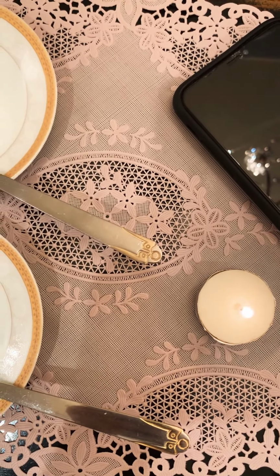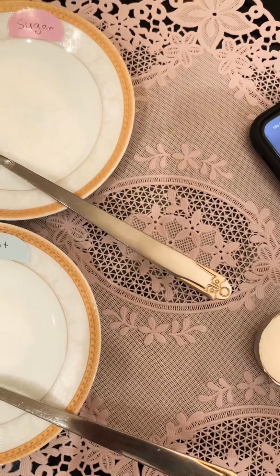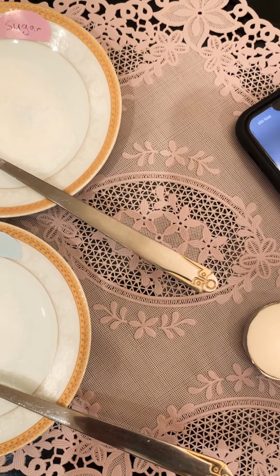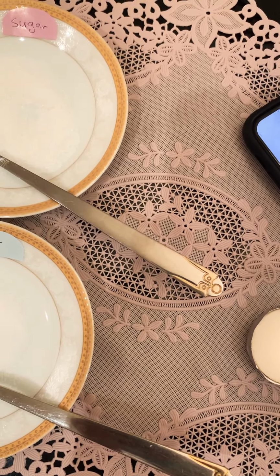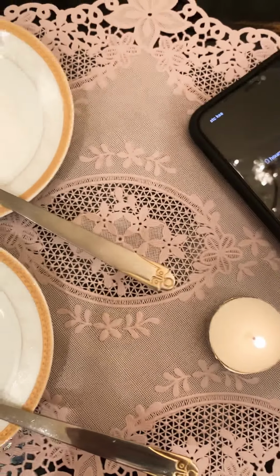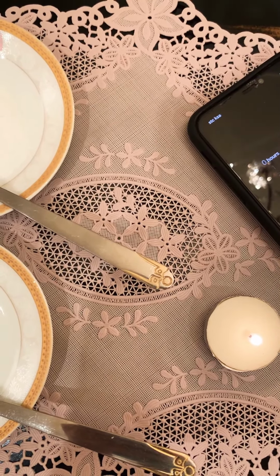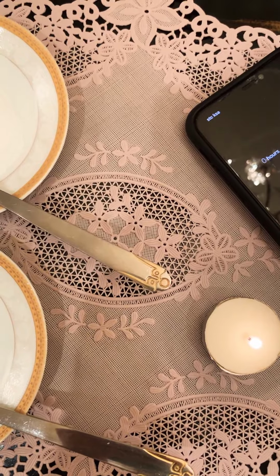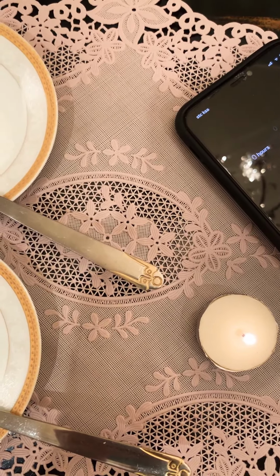This is a quick lab in chemistry. Today, inshallah, we're going to have a quick comparison between molecular compounds and ionic compounds. During the classes, we know that molecular compounds are atoms bonding together covalently by forming a covalent bond, and this bond is formed as a result of sharing electrons.